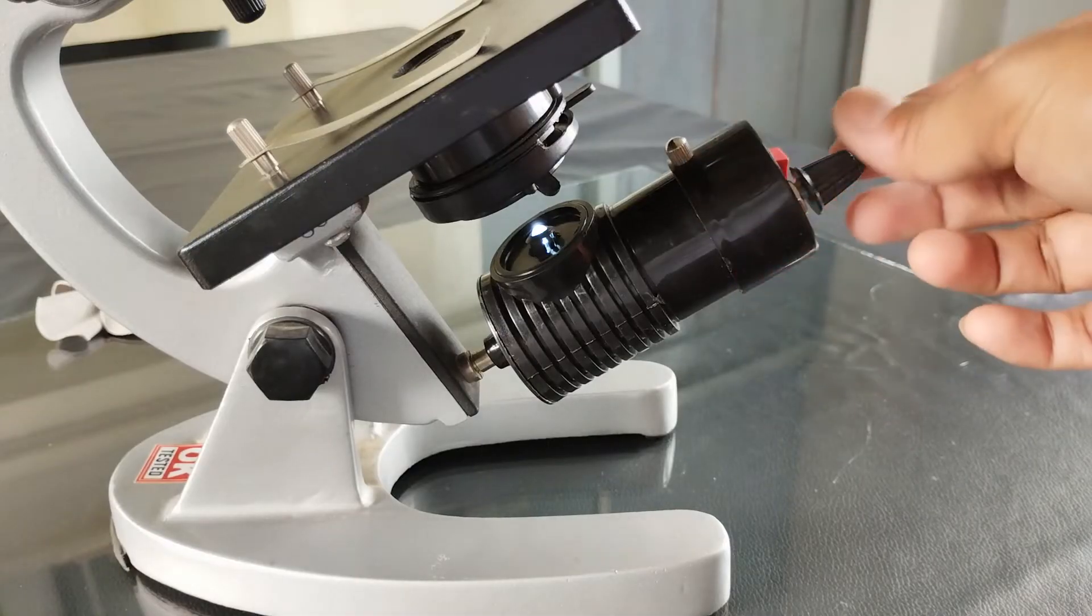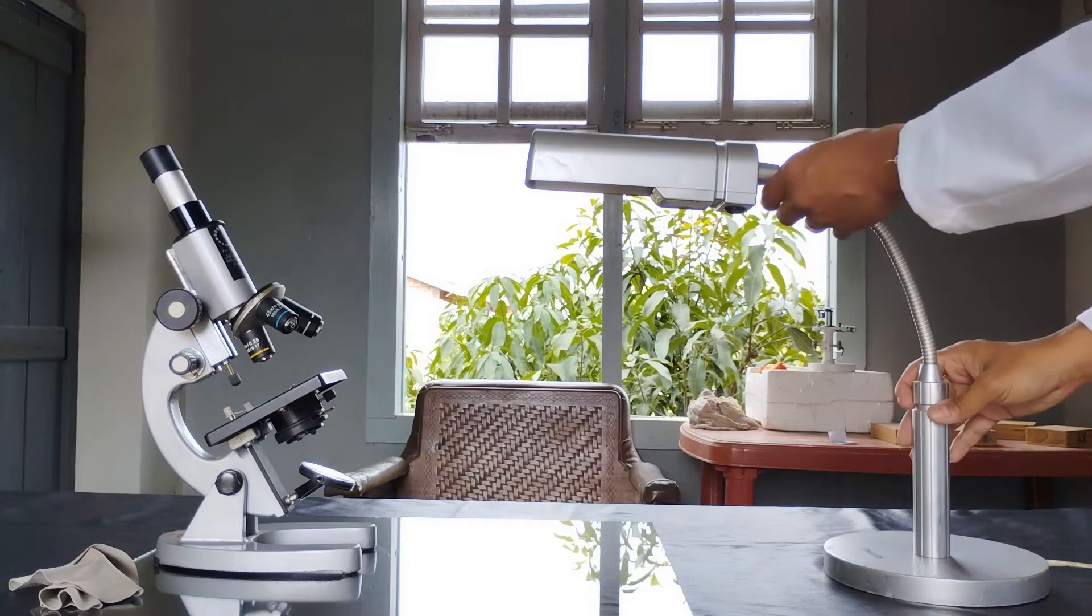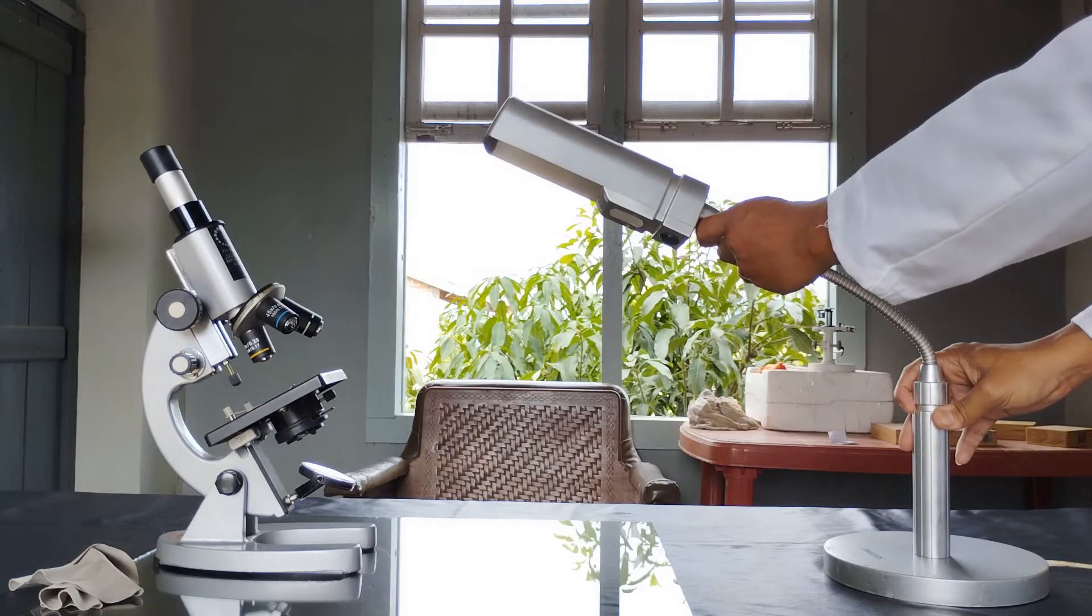If artificial light source is used, adjust the intensity of the lamp or position the external lamp such that the circular field of view is uniformly illuminated, but not uncomfortably bright.